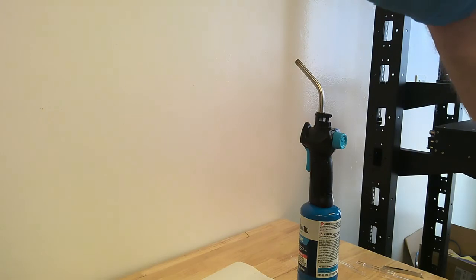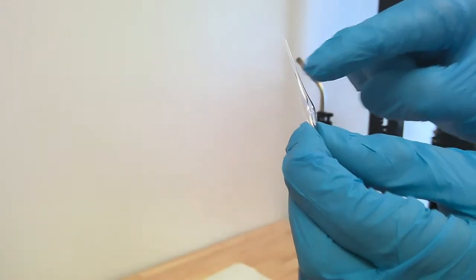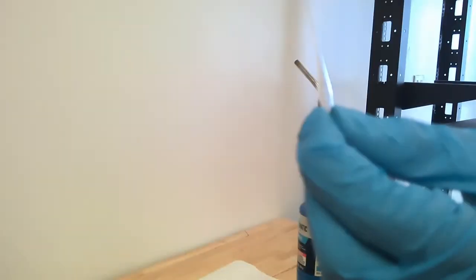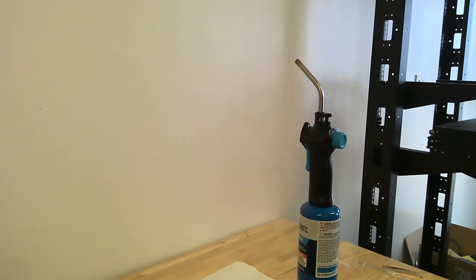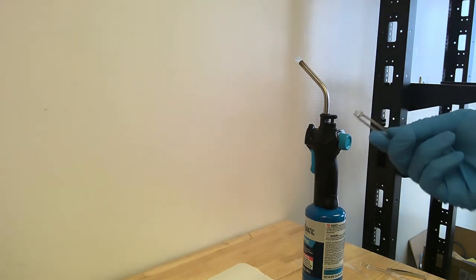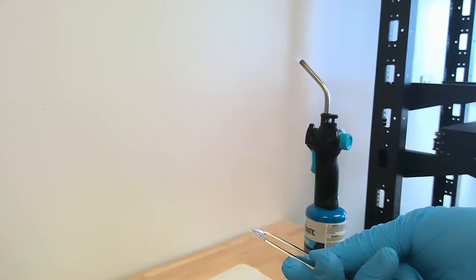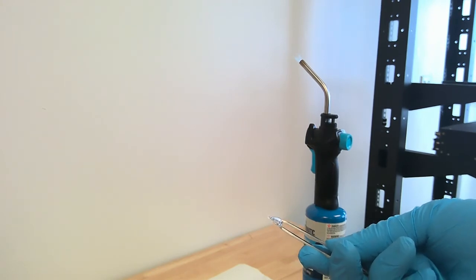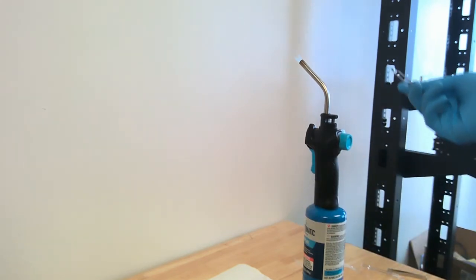To continue off with the picnometer that we left last time, we're just going to do a small aesthetic modification. We're going to trim this top piece of glass, and we're going to flame polish the edges. I'm going to trim off camera. So we've trimmed the end of our micropicnometer using our glass scoring device. And then what we're going to do now is flame polish the ends of our micropicnometer.